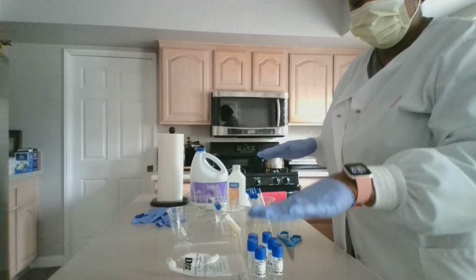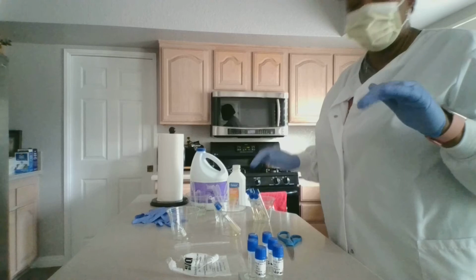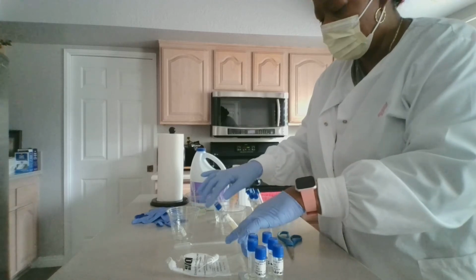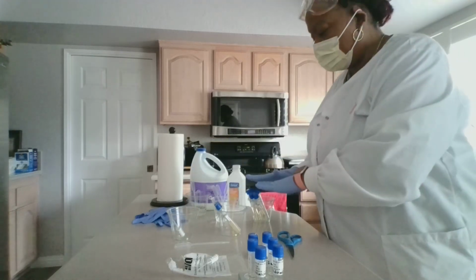And I will go ahead and do the same steps that I demonstrated for these. And same here with my active cultures here. And then my HCl and my NaOH here for these.